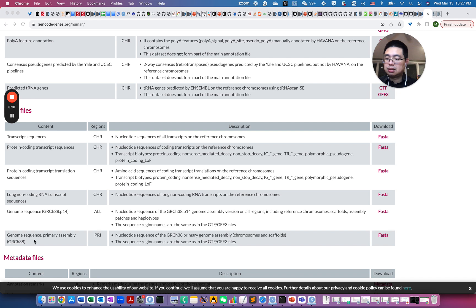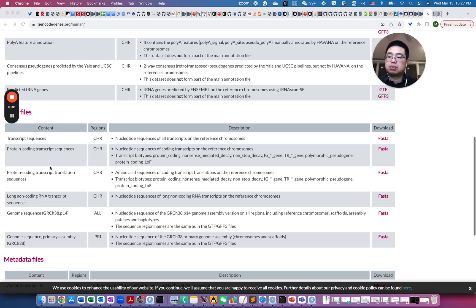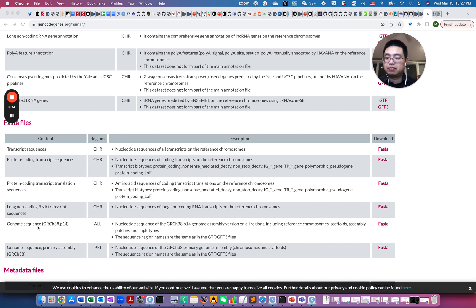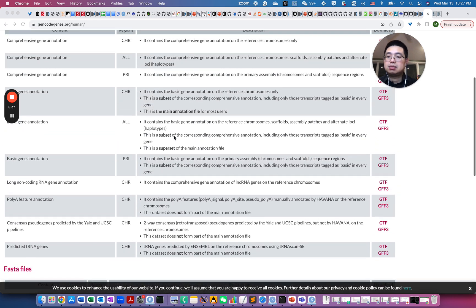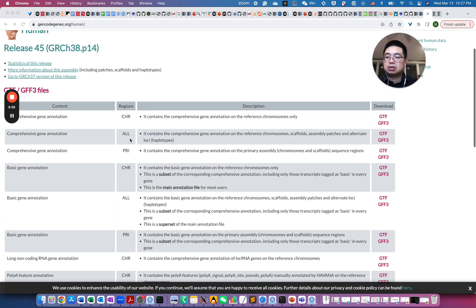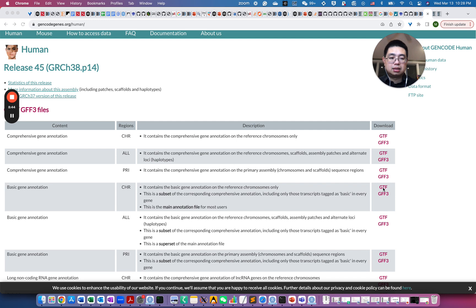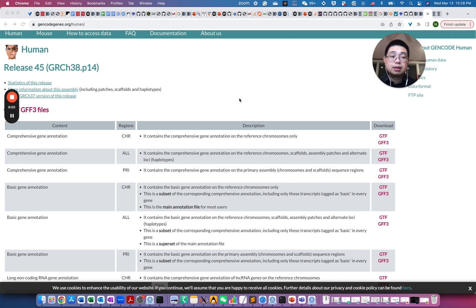So those are the transcriptome sequences and those are the genome sequences. So remember we only need the transcript FASTA, not the genome FASTA. So we just download this one and also GTF file. So we'll download actually either the basic gene annotation or the comprehensive gene annotation. So either will be fine.